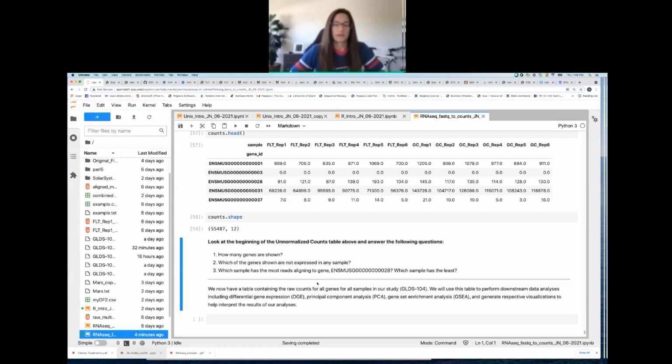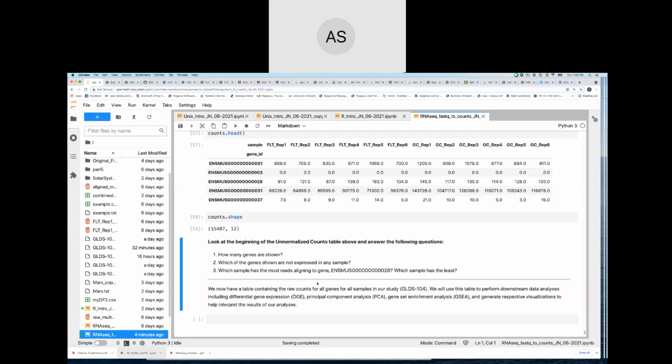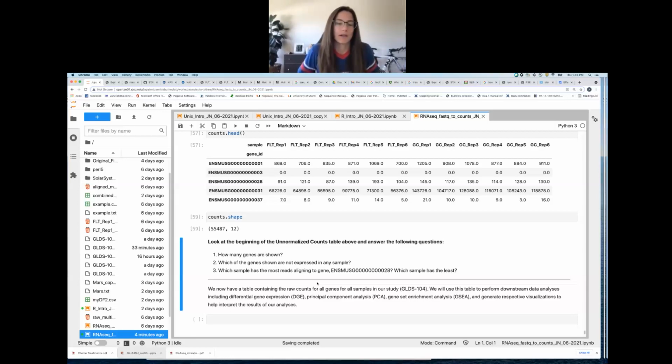So you mean that we might not necessarily know right now that there are duplicates? Right. So where did the 30,000 number come from? I've looked it up a few times, how many annotated genes there are in humans and mice. I see. Yeah. So I'll double check that, and so that's why we're going to transfer these gene IDs into common names or gene names.